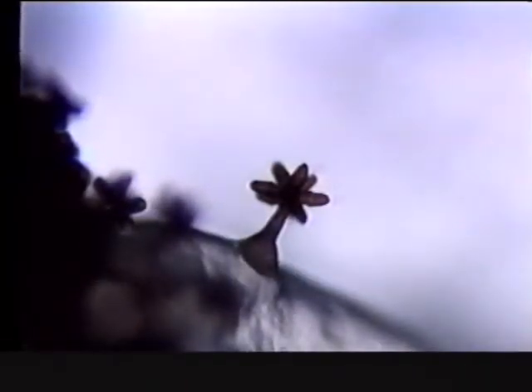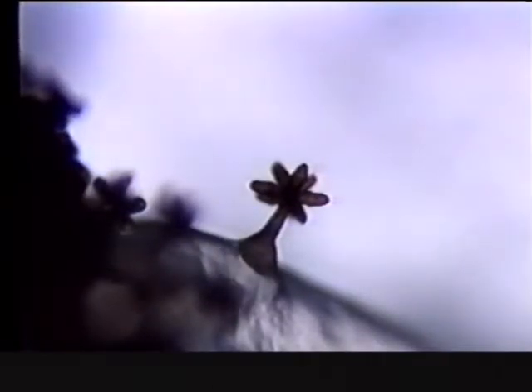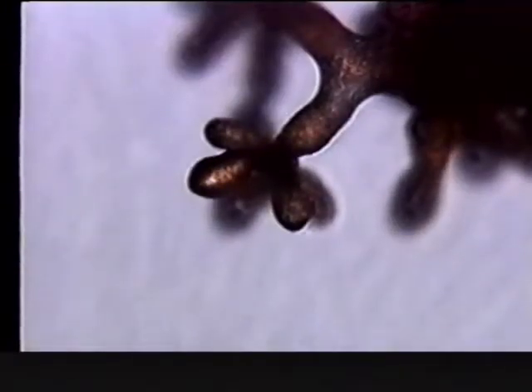As I say, this is about 1/10 of a millimeter tall, and they are orange in color. This particular strain was isolated from decaying wood on the campus of Indiana University. This is a top view of the fruiting body, and you can see multiple sporangia, but you cannot see the stalk. They are supported by a stalk. Here is another view from the side, and you can see that the stalk is bifurcated here, so that there are actually two stalks, which is unusual.